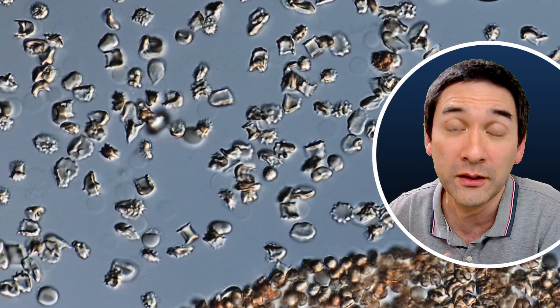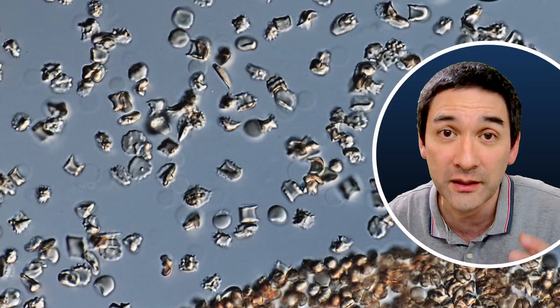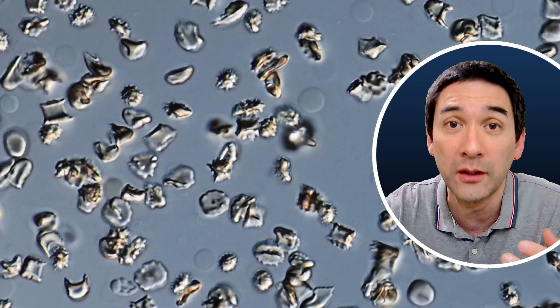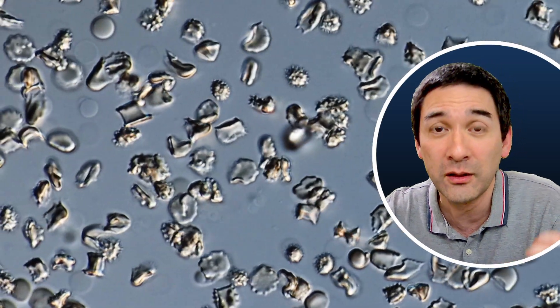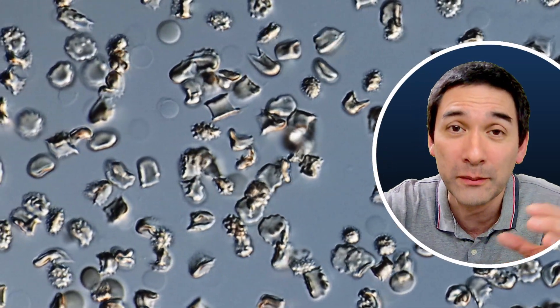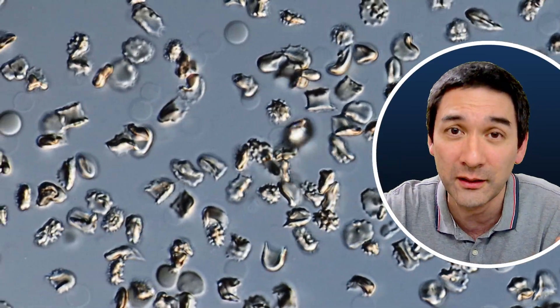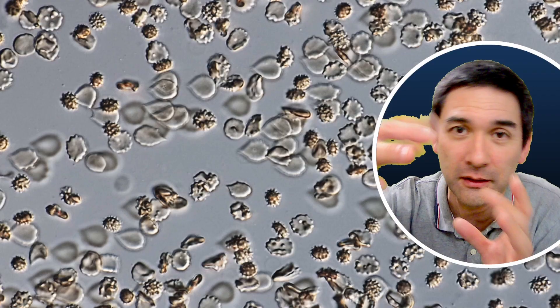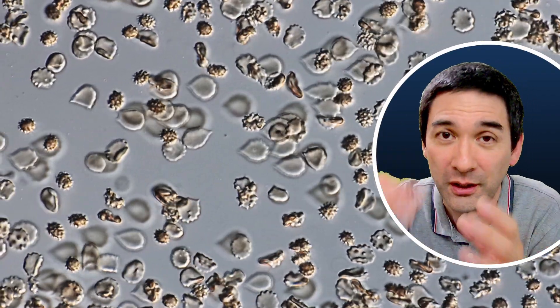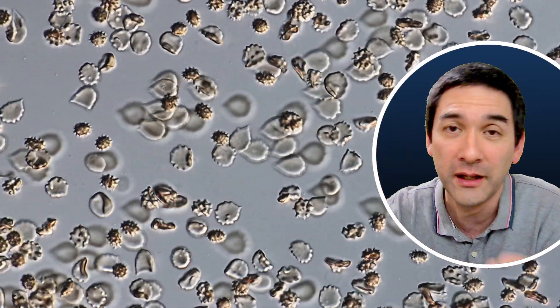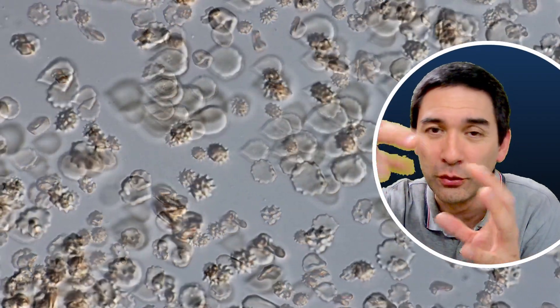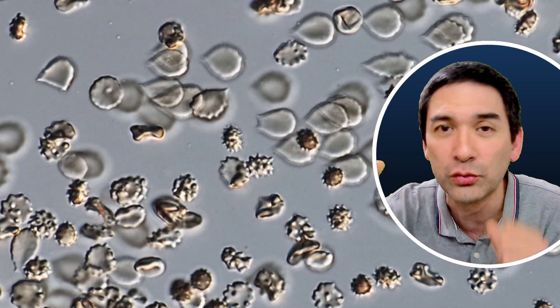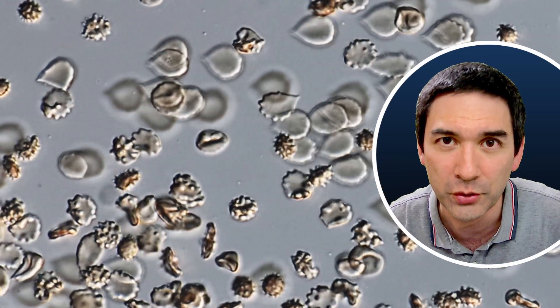Because what happens? The salt water that surrounds the cells will pull out the water from inside of the cell. So that's called osmosis. And the water will move from inside the red blood cells. It will move out and this causes the contents of the cell to shrink. And then basically it starts to shrivel up because it's much smaller now. And then you have got the cell membrane on the outside, which kind of goes into folds and so on. And that's why they have these irregular shaped structures.